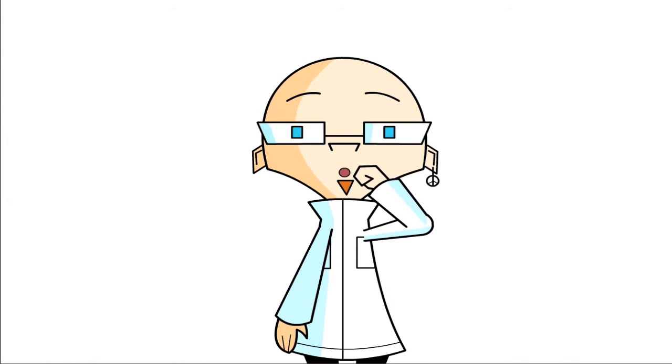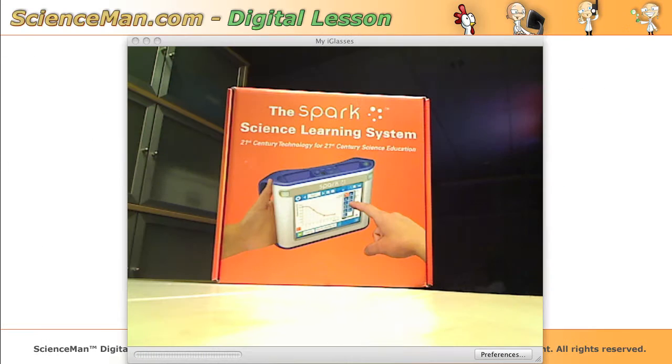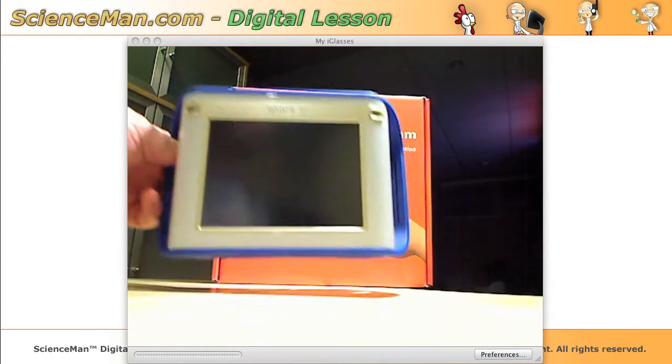Hello and welcome to another ScienceMan digital lesson. Today we're going to look at the SPARK science learning system from PASCO, and here it is.